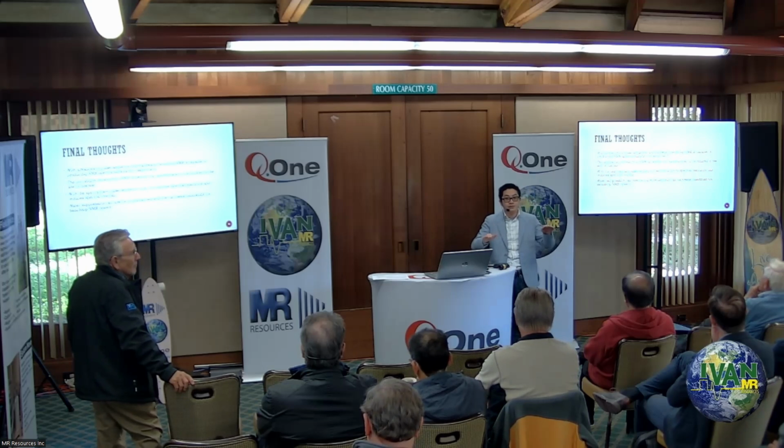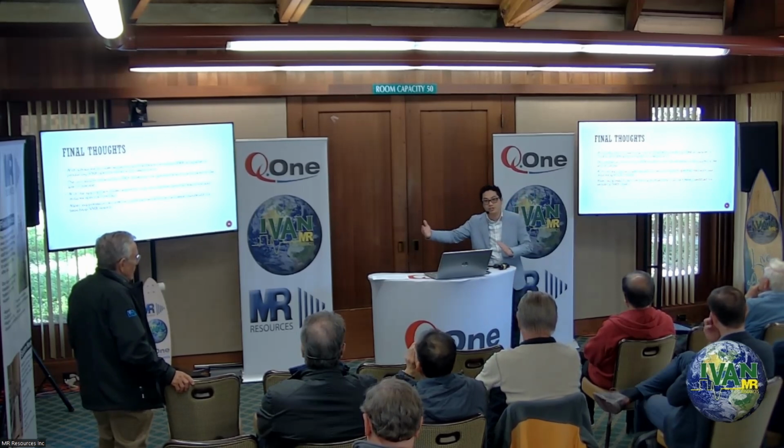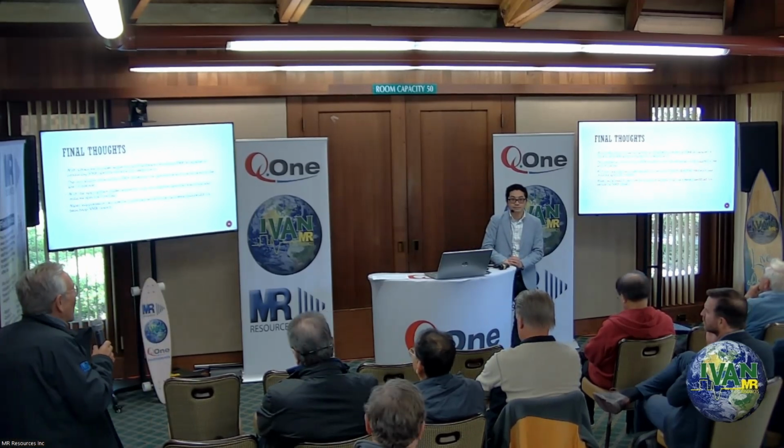If it's not phaseable, there will be issues with quantification, if you want to continue with that. Thank you.